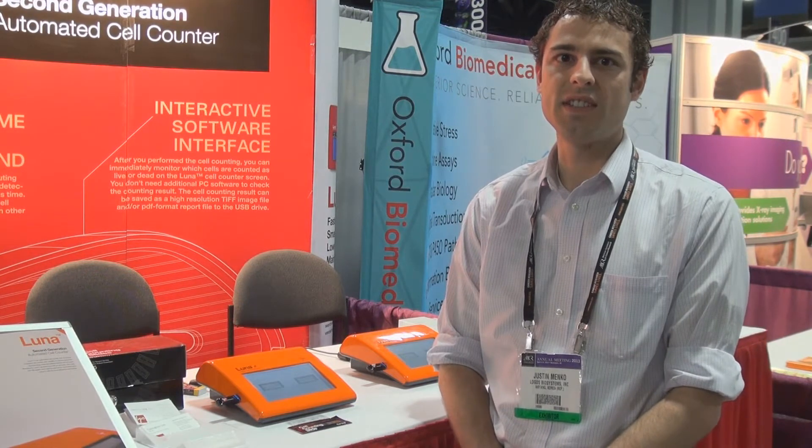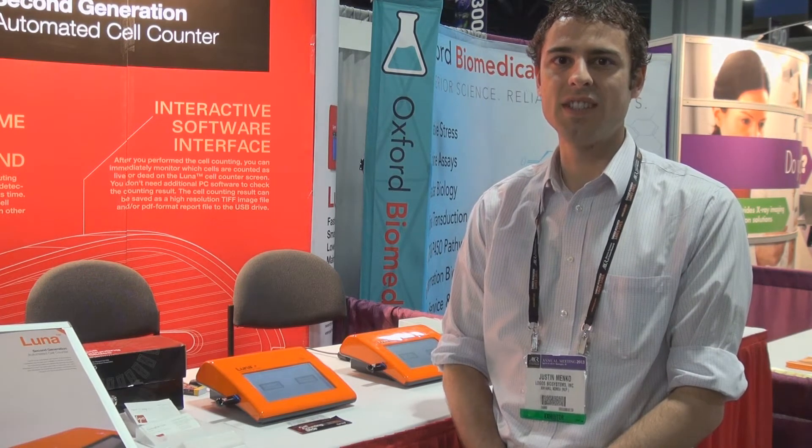Hi, my name is Justin. I'm here at AACR with Logos Biosystems, and we are introducing the Luna FL, the automated cell counter made by Logos. The Luna FL is an automated fluorescent cell counter that counts red and green fluorescence as well as standard bright field, giving scientists a wide variety of applications for their cell counting needs.